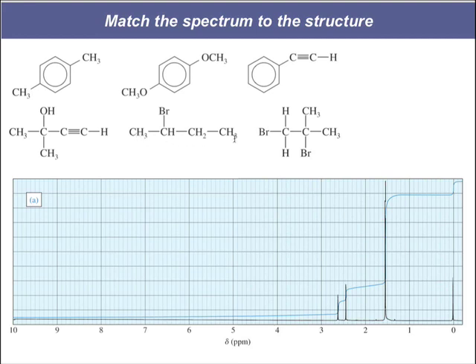How about over here? We've got these CH3s and we've got these CH3s, but those are different because these CH3s on the left are closer to the bromine. So we've actually got 4 signals here. We've got the CH3 next to the bromine. We've got the H on the carbon with the bromine. We've got the 2 hydrogens adjacent to the carbon with the bromine.